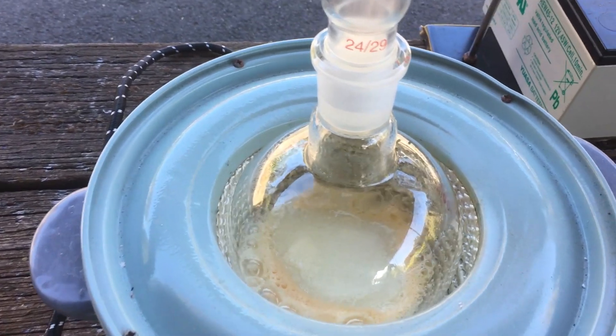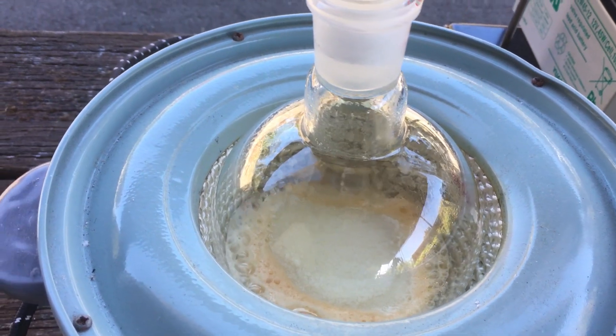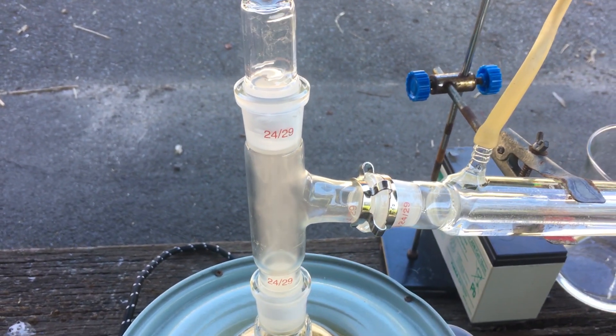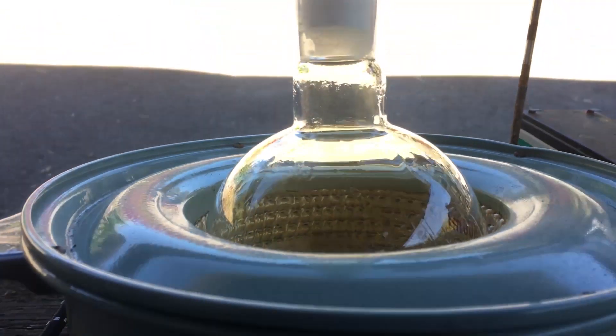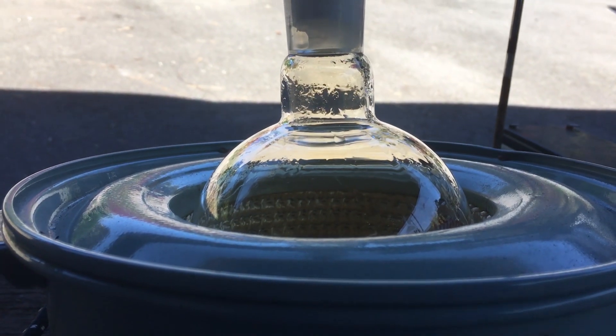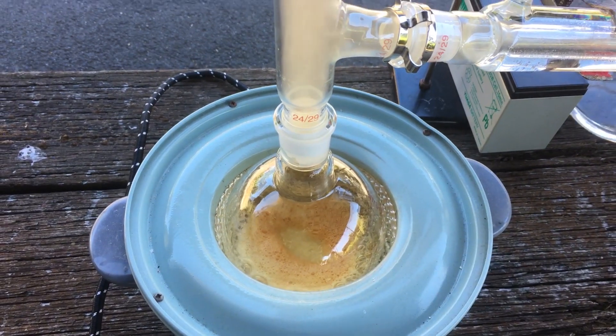With that, you can see we are already starting to produce what I believe to be nitric acid. You can see it starting to flow through our apparatus now — look at it go. There's also a slight yellow colour in the flask indicating the presence of nitric acid and nitrogen dioxide, so that's very promising.